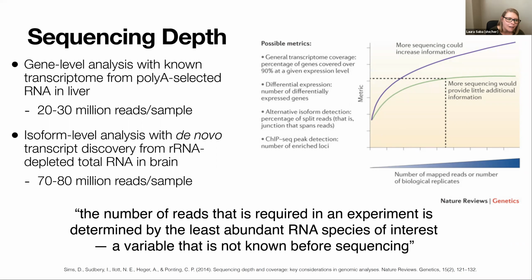at a low sequencing depth, you're going to have enough coverage for many genes. You may even have enough coverage for most genes, but you're not going to have enough coverage for all genes without doing millions and millions and millions of reads, right? And we don't go in knowing what our gene of interest is, or what level of coverage our gene of interest will have. It's very much a global power analysis. It's some of these global decisions. We're never going to catch everything, but our hope is to catch many things.